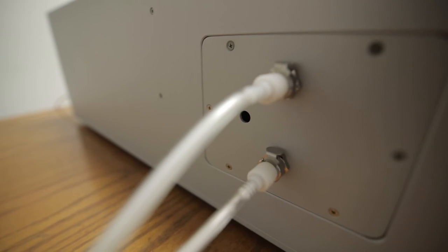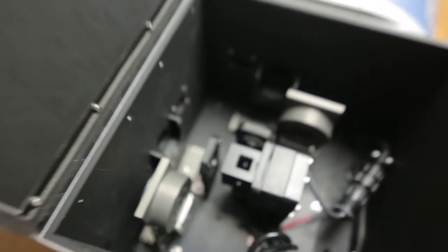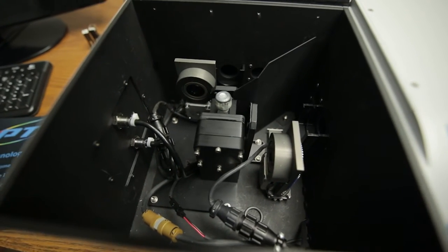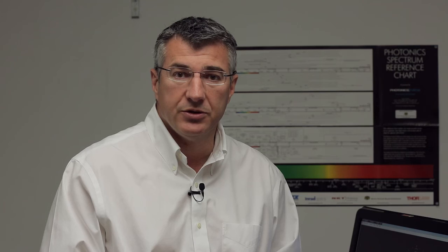The basic unit comes with a cuvette holder that is water-jacketed so that it can be hooked up to an external water bath, and you can then adjust the temperature for solution-based samples. However, we do have other sample holder accessories, we have a Peltier based cuvette holder, the Peltier based cuvette holder actually is in this particular instrument, and that allows for software controlled temperature, it's primarily useful for protein folding folks that are looking at melting studies, but any experiment where you want to do automated acquisitions at controlled temperatures, the Peltier accessory is highly recommended.